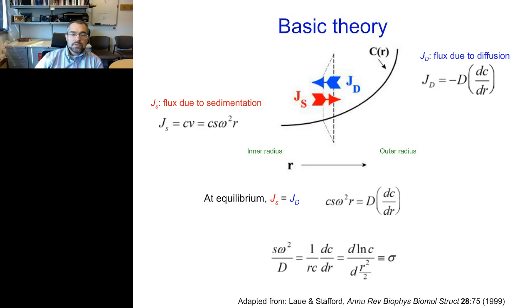So if we look up here in the center, we see an illustration of our sedimentation equilibrium experiment. You can see the exponential curve that is our stable concentration gradient. And in the middle, you'll see this plane, which I'm highlighting with my red lines here. So you can imagine that there's a plane through the middle of our sample.